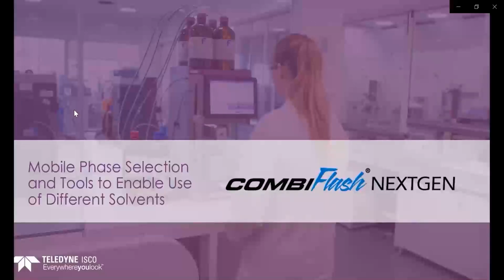So finally, what we're going to end with is some tools on the CombiFlash NextGen series that allow us to use different mobile phases, and it helps expand some of the stationary phases and tools that we can use as well, because we have different mobile phase systems we can use.